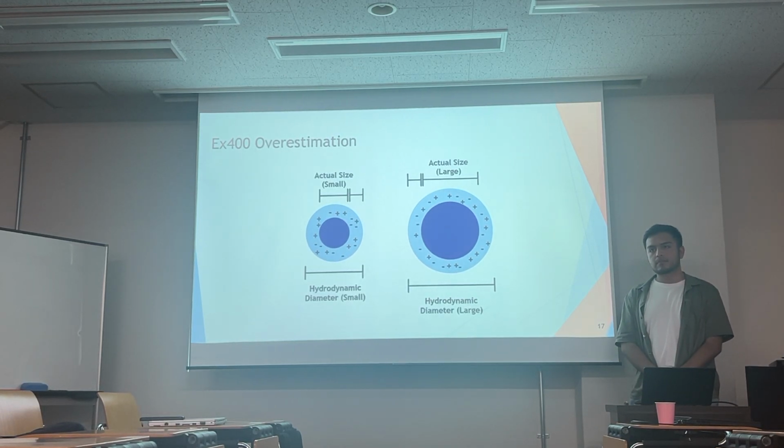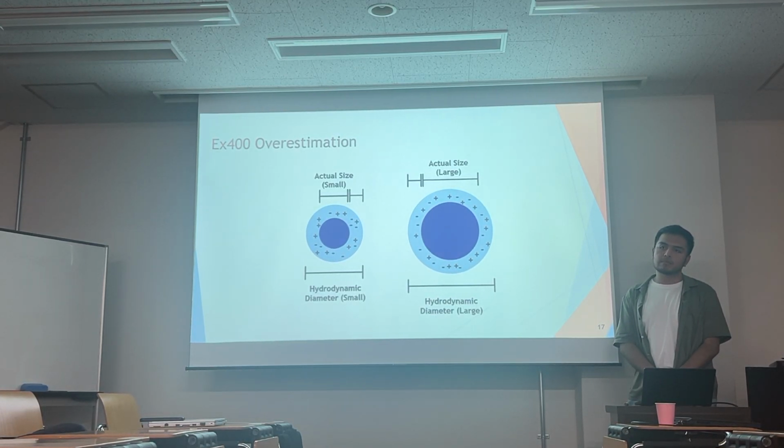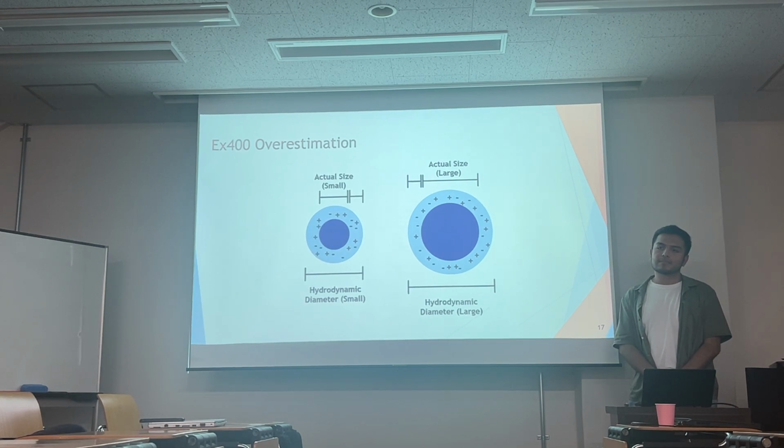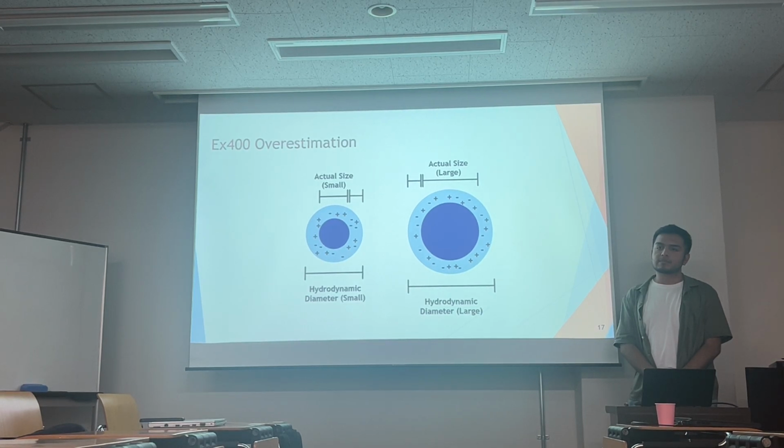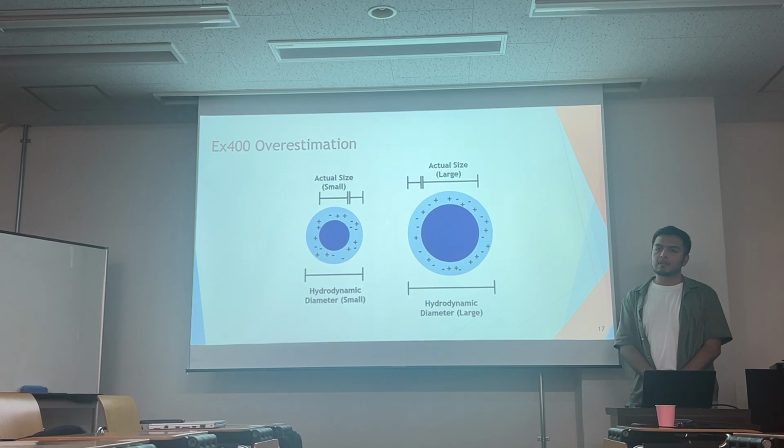I want to know that when you change the solution, the difference between actual size and hydrodynamic diameter will change.